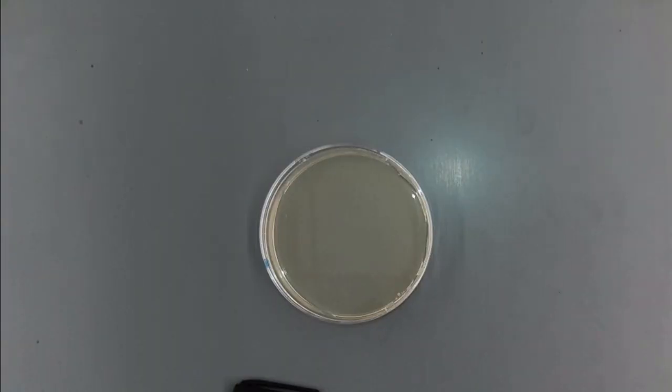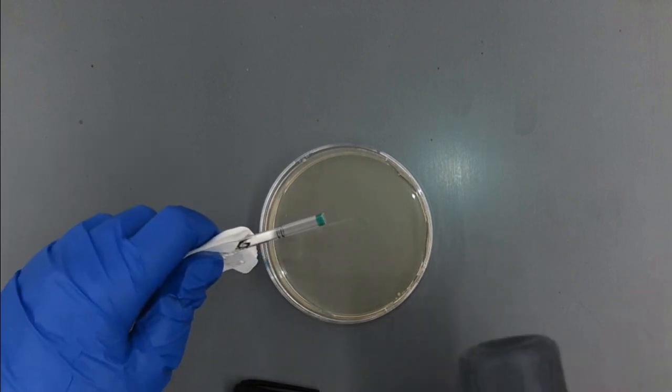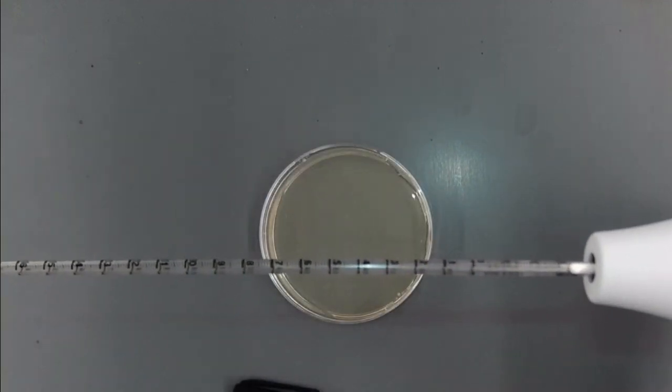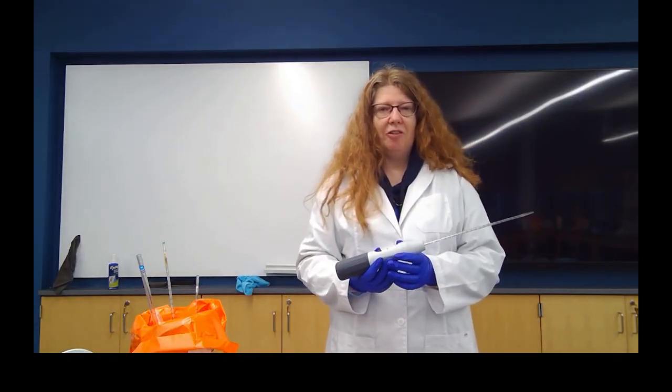For this, we're going to use our pipette again and use the bulb and the sterile pipette, which we see here, to take 0.1 or 1/10 of a milliliter. So I'm going to peel down part way, insert it into the bulb, and withdraw the paper. Remember, I don't want to touch this to anything to keep it sterile.